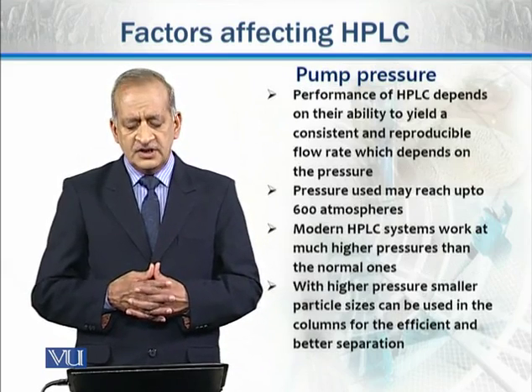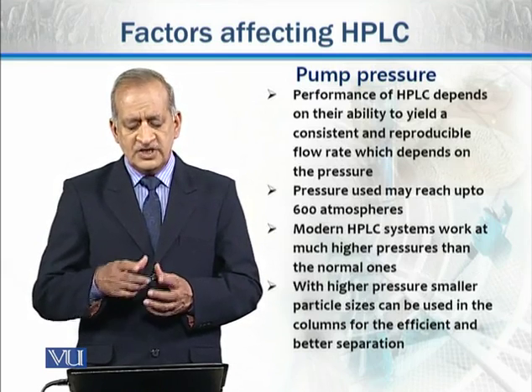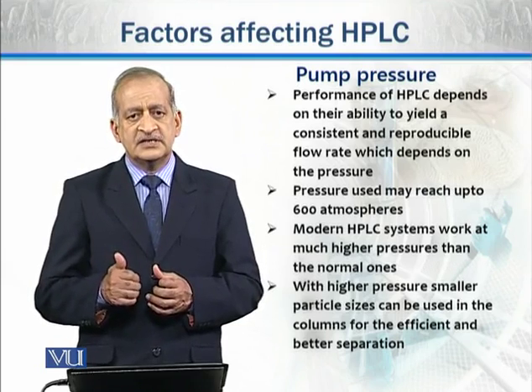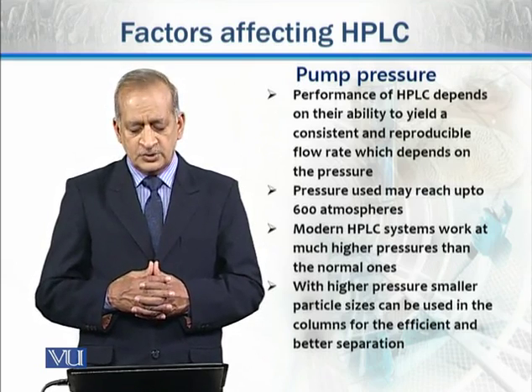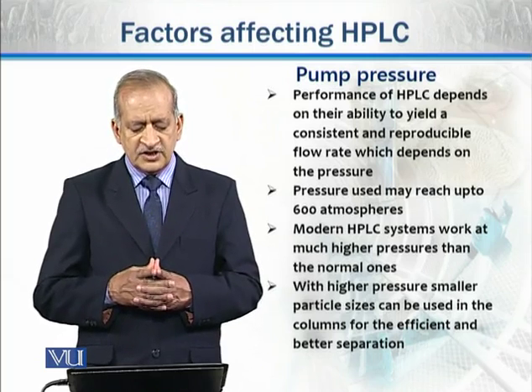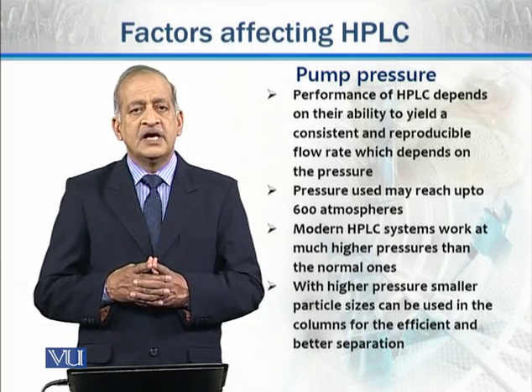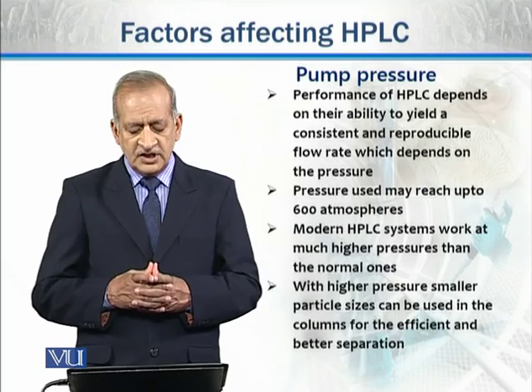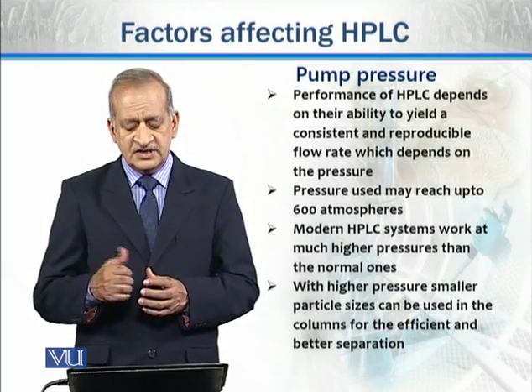Now, pump pressure. We all know that this separation through HPLC takes place due to the pressure applied. So as pressure increases, separation efficiency also increases. The performance of HPLC depends on the ability to yield a consistent and reproducible flow rate, and this flow rate is maintained on the basis of pressure. Pressure which is used here may be even up to 600 atmospheres.